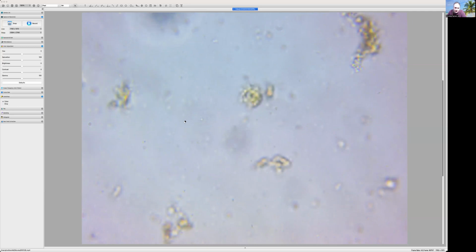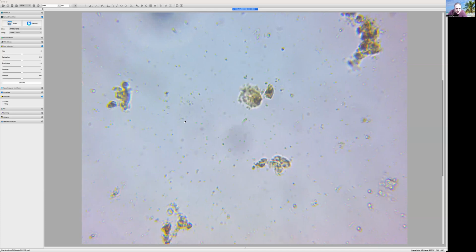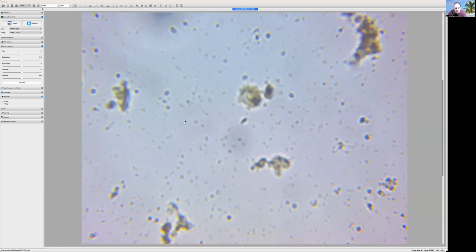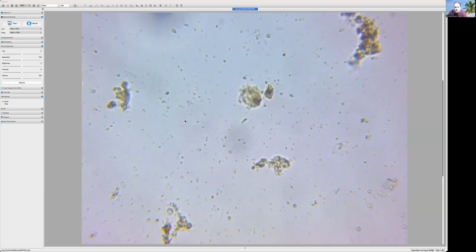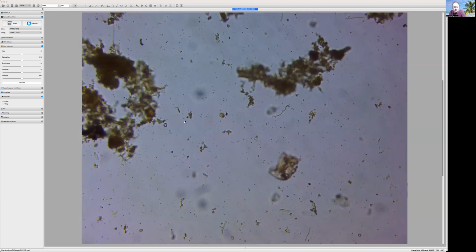Oh boy. Okay. No super fast moving race cars. And that's good. So I just want to back out here to see what we can see just on this slide a little bit.